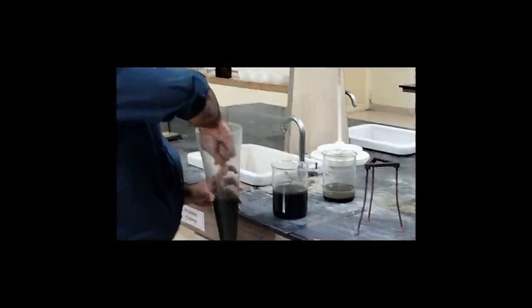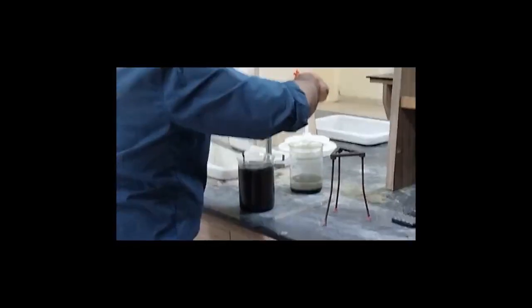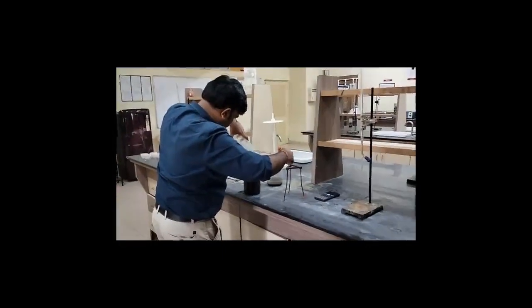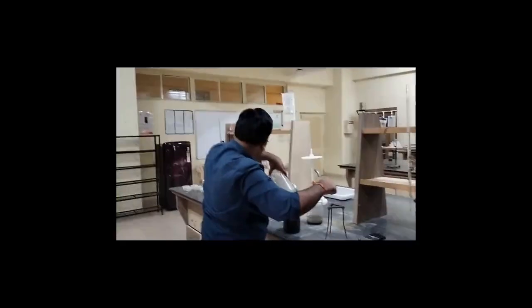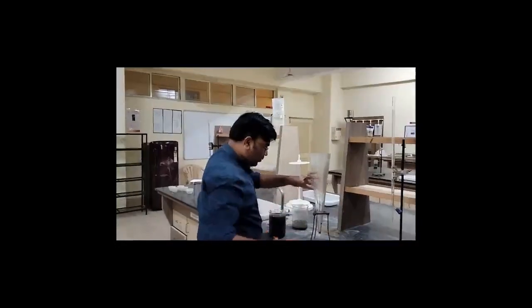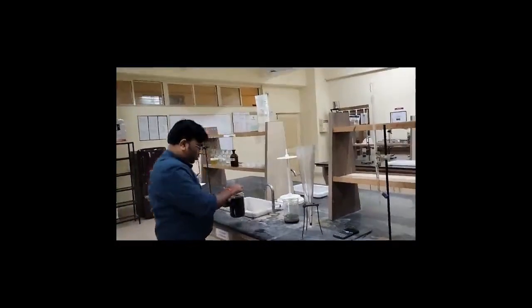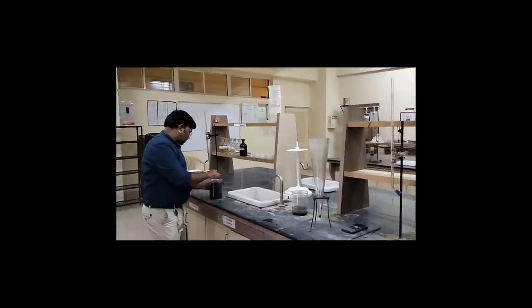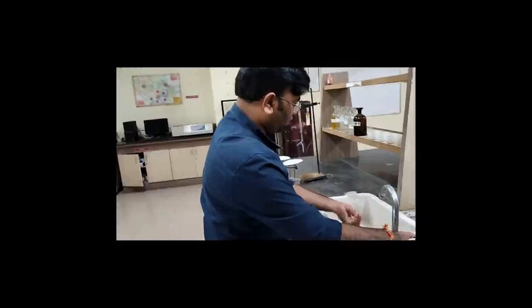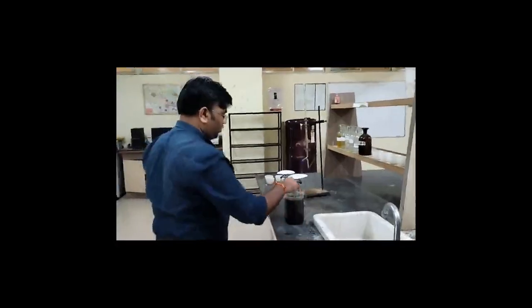And then you can perform the practice. Right, so now that we have removed all this sample from it, we have to take the sample for MLTS and MLDS. We are going to take 25 ml, as this contains a huge number of solids, right? So we are going to take 25 ml of sample.